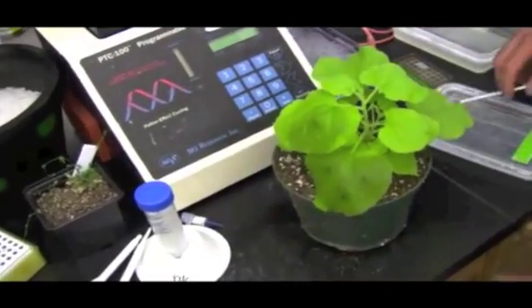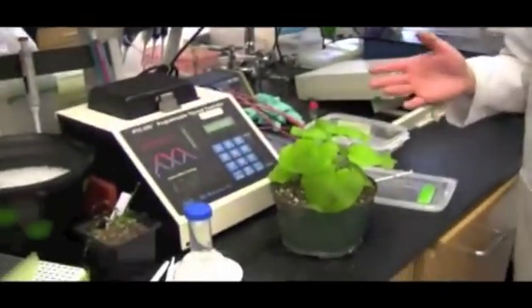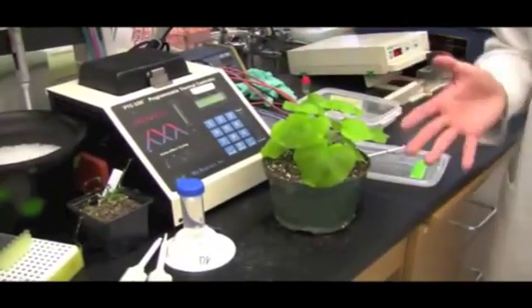So now you have to give the bacteria some time to grow and to infect some of those cells. And so this is going to take a couple days, but I have an image of one that someone else in another lab took on the computer over there, and I'll show you guys what it looks like when you look underneath a UV light. Because again, if our molecule that fluoresces is attached to our protein, we can see it.